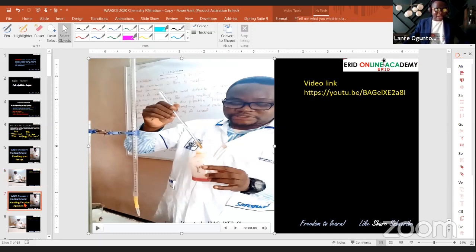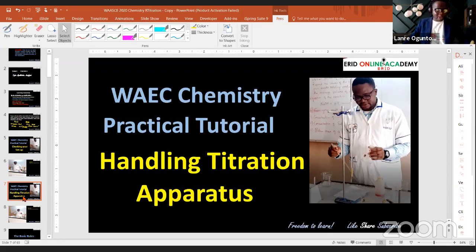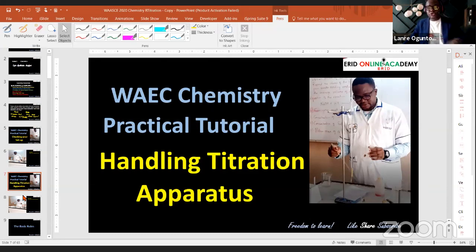Now let's look at how you handle titration apparatus. Okay, so I want to take you through these rudiments. They will now go into your calculation, which is very, very important.